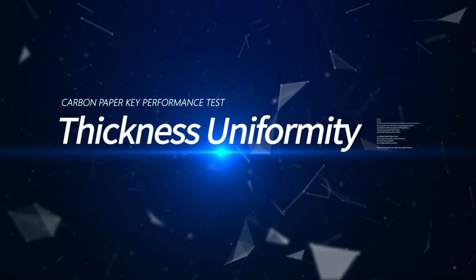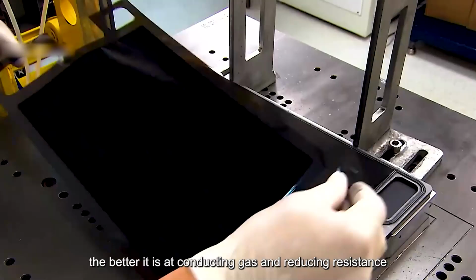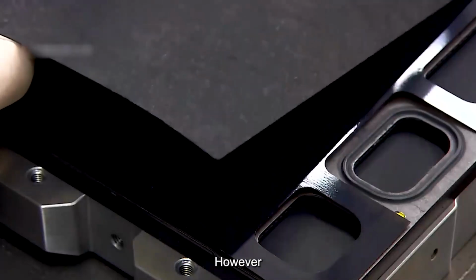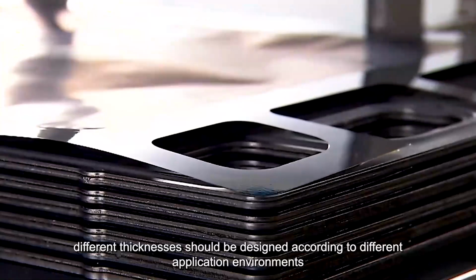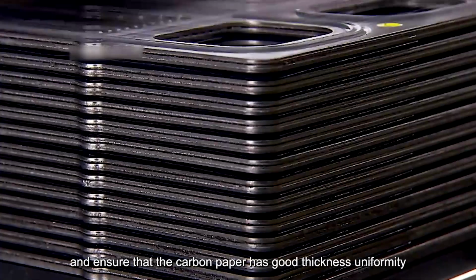Thickness uniformity. The thinner the gas diffusion layer made of carbon paper, the better it is at conducting gas and reducing resistance. However, considering the strength requirements for the catalyst layer support, different thicknesses should be designed according to different application environments, and ensure that the carbon paper has good thickness uniformity.